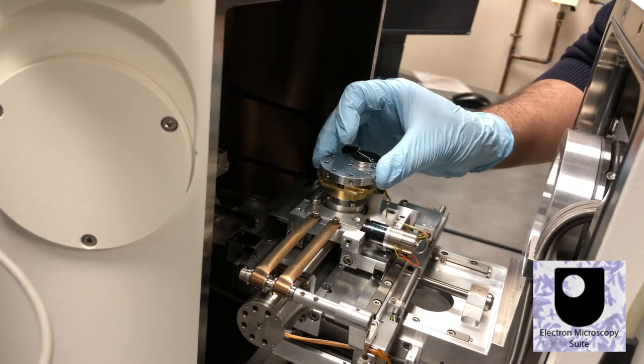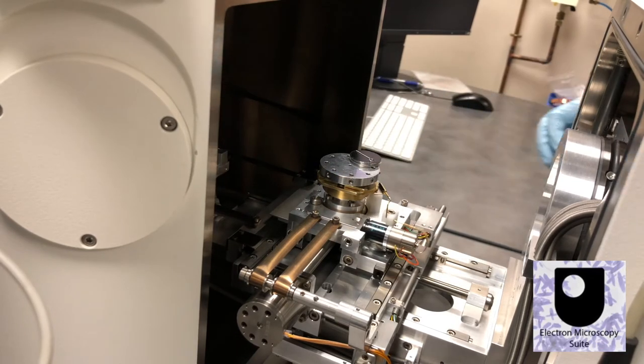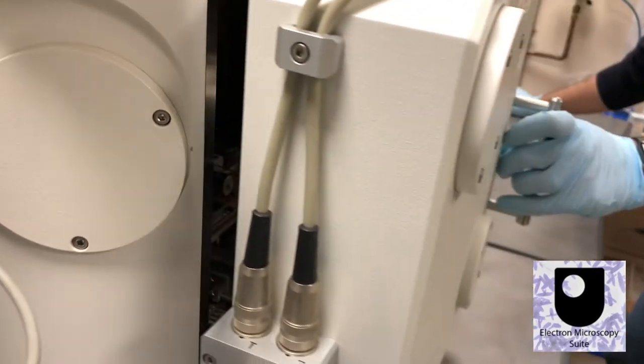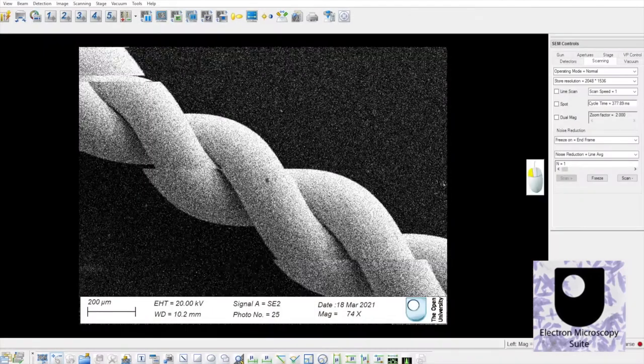Imaging can begin after sealing the chamber and achieving the target vacuum pressure.